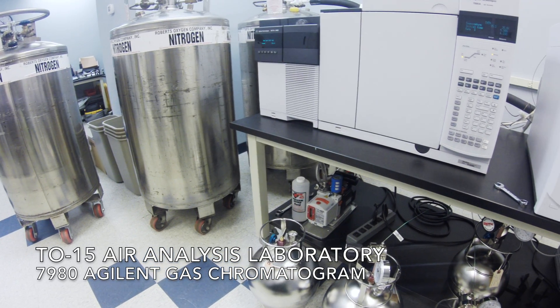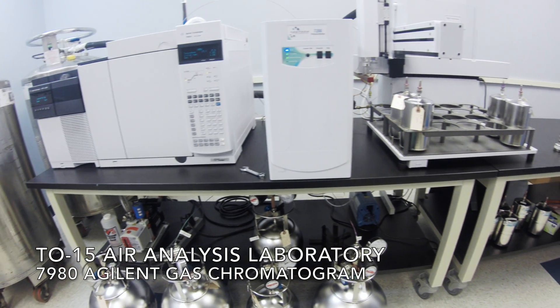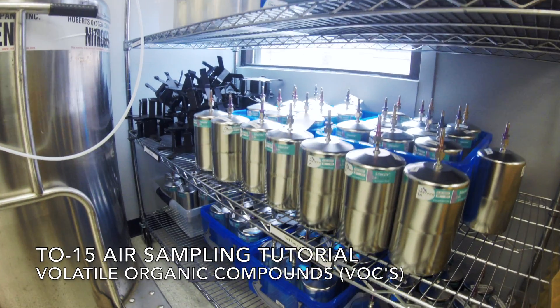Welcome to the Phase Separation Science TO15 laboratory. We are committed to providing our clients with the resources to ensure the highest sampling quality. In this video you will learn how to properly take an air sample for VOC analysis.